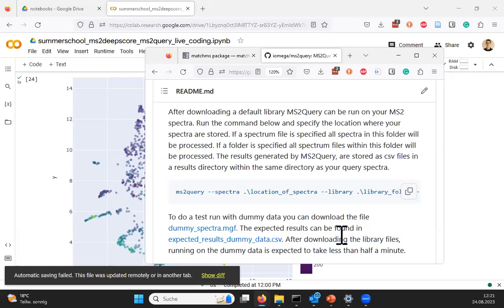If you run this data set that we have here, there are about 6,000 spectra. On a regular notebook, it will take about one or two hours. So it's not something we're live coding, but you could easily run it and say, give me for everyone the closest analog in GNPS according to our scores. Then you will get back a table, a CSV file with all the information. For here in the workshop, we have provided these files. You also find them in the Google shared drive folder, files for the group 1 and group 2 data sets.